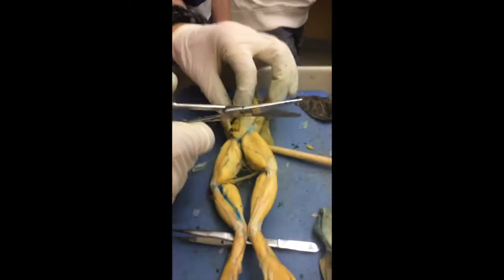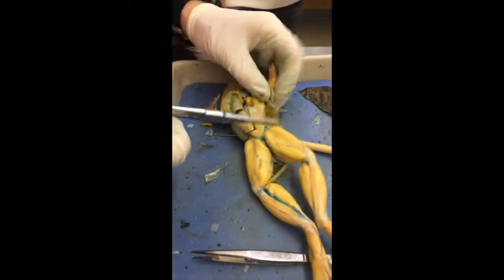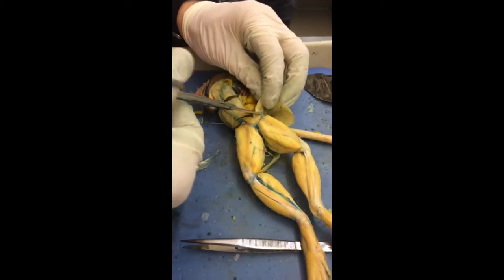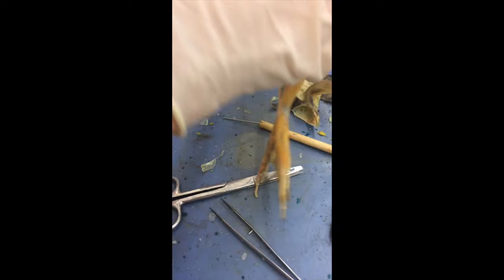Did you just cut them off? Flaps? Yeah, you can cut them off. Why don't you make one big flap like the fish instead of a bunch of small ones? Because I'm peeling this back.